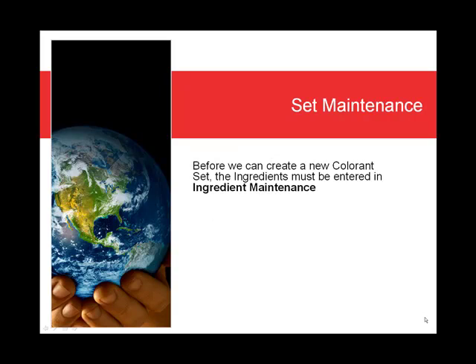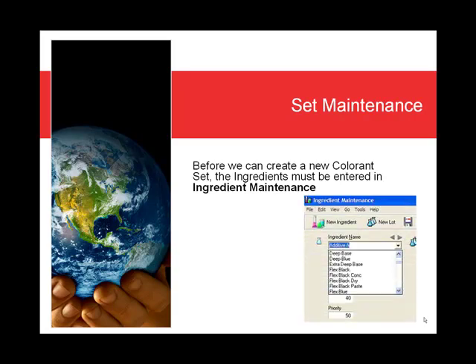Before we can create a new colorant set, the ingredients to be included in the set must be entered in ingredient maintenance. How to do this is explained in the ingredient maintenance video.